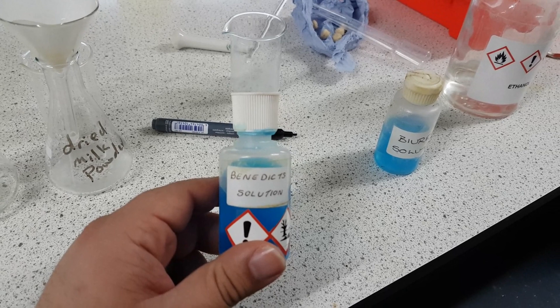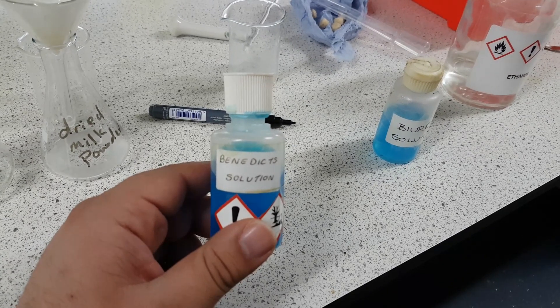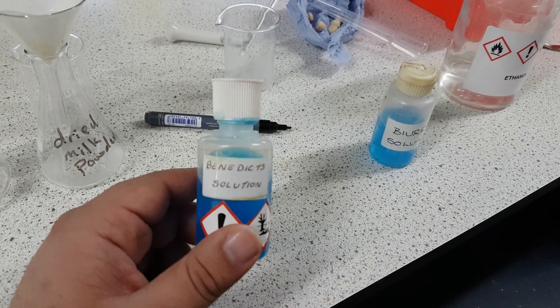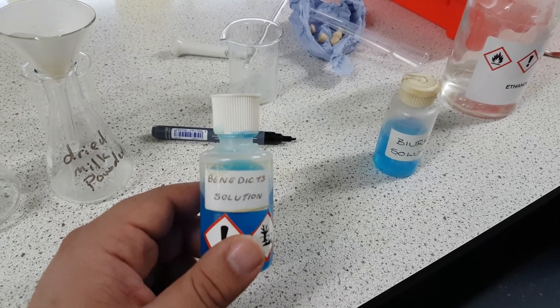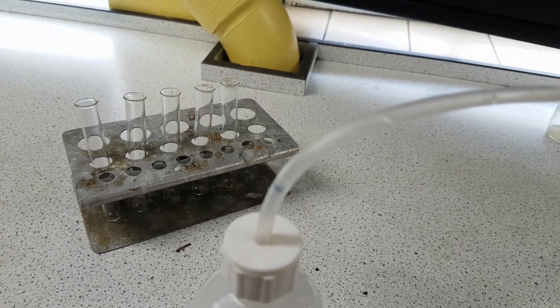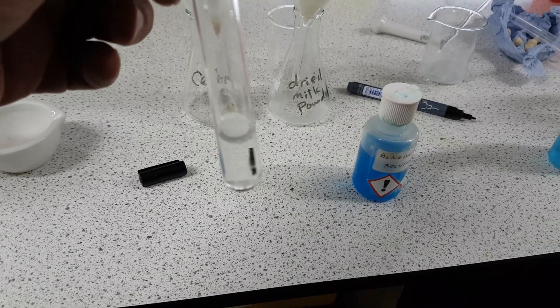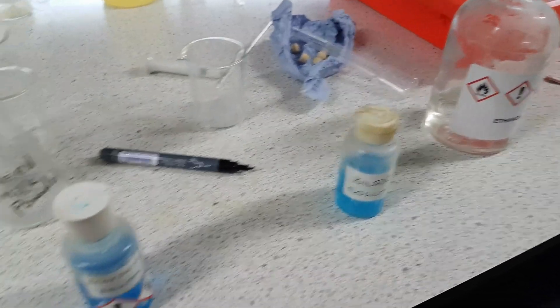Before we test the food solutions we need to find out what a negative result looks like. The way we do that is we make a controlled test tube — a controlled test tube will have deionized water in it. Deionized water does not have carbohydrates, does not have proteins, does not have fats, therefore it will produce a negative result. So I'm going to fill up three test tubes with deionized water and add Benedict's into one, Biuret into another, and ethanol into the other, just to see what a negative result looks like.